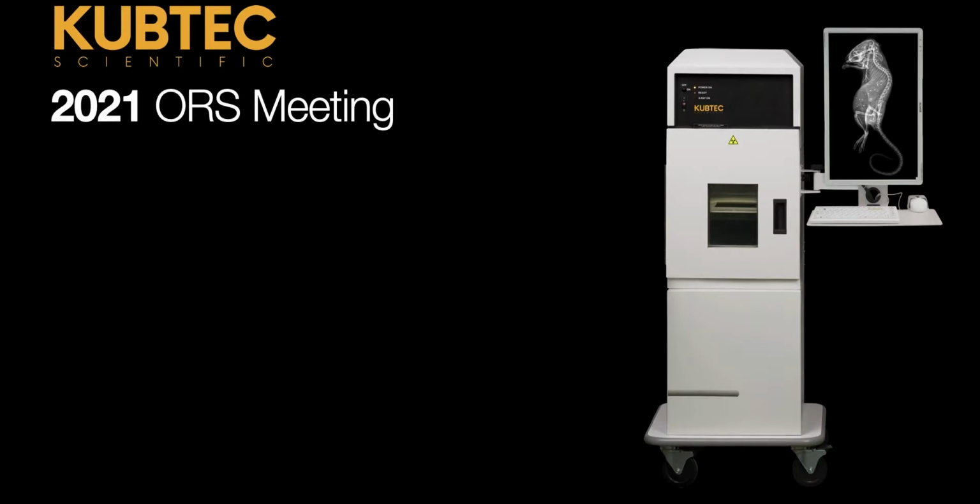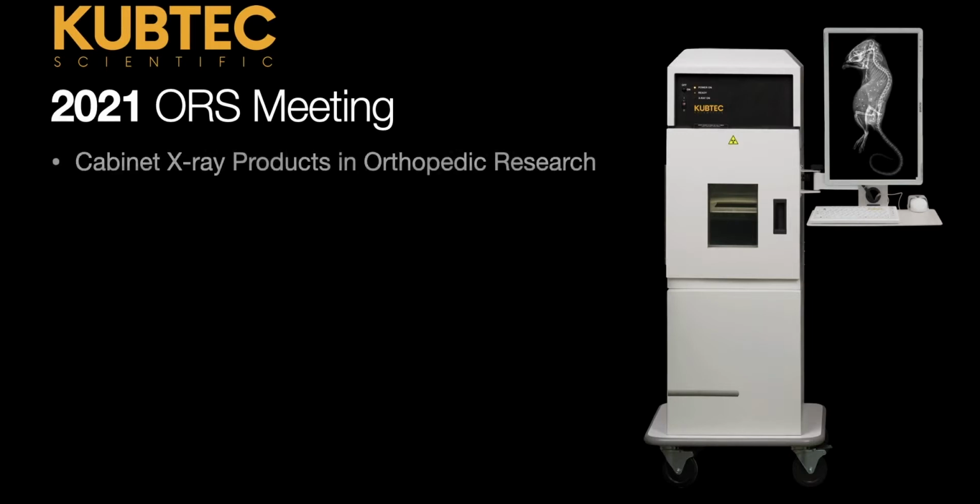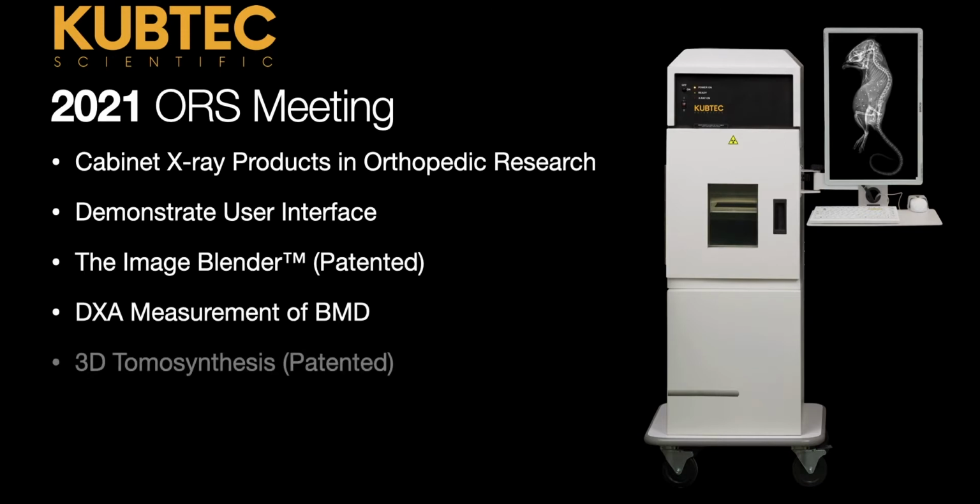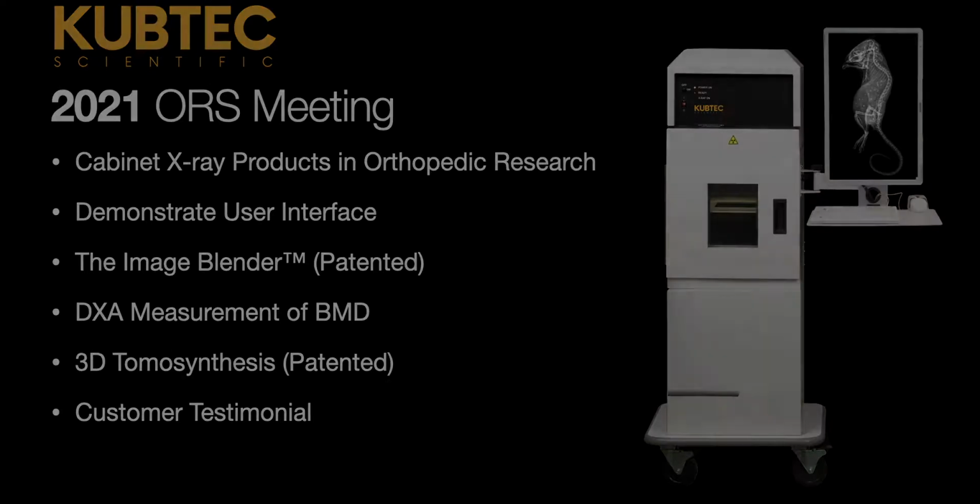In this video, we would like to introduce you to our cabinet X-ray products and show you how they are being used in orthopedic research. We will be presenting a demonstration of the user interface for high-resolution X-ray imaging, blending our high-resolution X-ray images with optical images of the sample, DEXA measurement of bone mineral density and body composition, and finally, 3D tomosynthesis imaging on a mouse specimen. You will also hear from some of our customers on how they use Kubtec cabinet X-ray systems in their research.